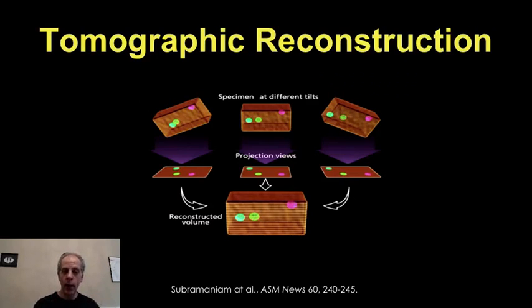And just to say once again what kind of data we have, we got tilts. Basically, we had the specimen, we rotate, we throw the electrons at it, we get one projection. We do a different rotation, we get a different projection. A different rotation, a different projection. Then we put them together and we get the three dimensions. So I'm going to always show you slices of this because most of the time I'm going to show you 3D when we get the reconstruction. But remember, this is supposed to represent this. And we obtain it. So here was the specimen, very, very tiny. And here is the image in the computer.